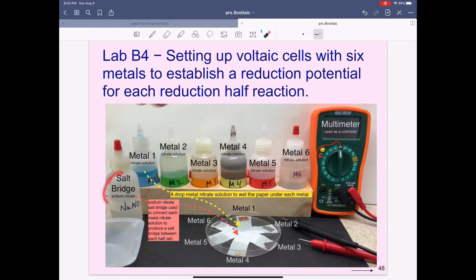Then we'll use a salt bridge and connect all of the solutions with the salt bridge substance. Each of the metals will have their own respective solution around it. Metal two will have this, metal three will get this solution.